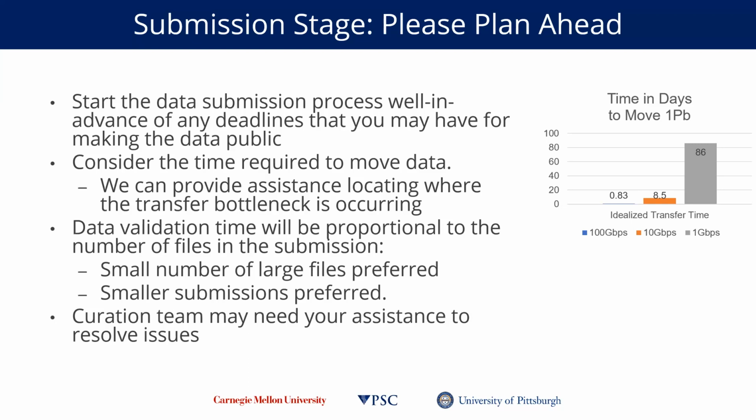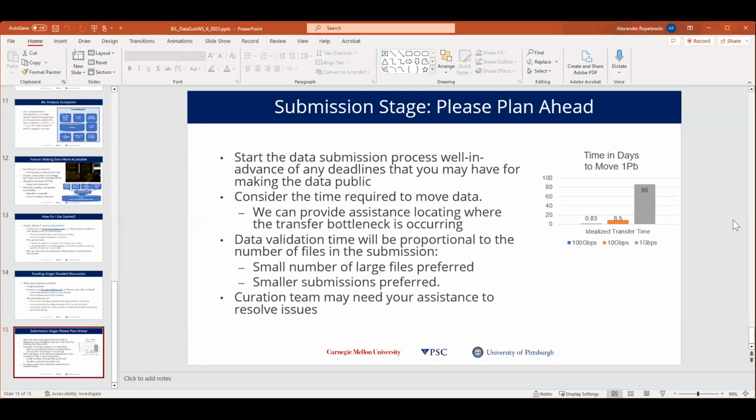And we also did want to mention that we do curate the data, particularly the metadata that we receive, and there have been some occasions where we need your assistance to resolve issues with your metadata. If such is the case, the curation team will get in touch with you, and we do need your assistance in those situations to resolve those issues. So that's all I'm going to talk about to introduce you to BIL.